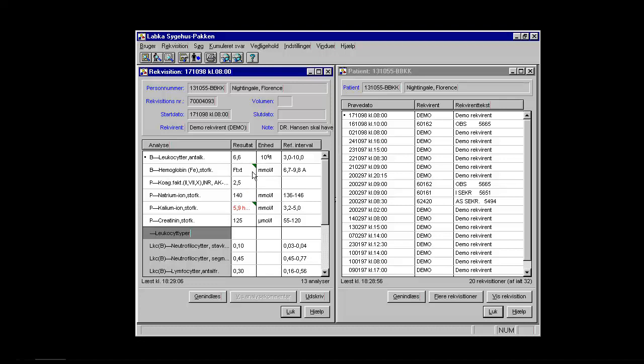I can see here that there is some information that is labeled. And that means the field is cut off. It might not mean much here, but it would have been a disaster if I had cut off a digit. It is on this safety measure.